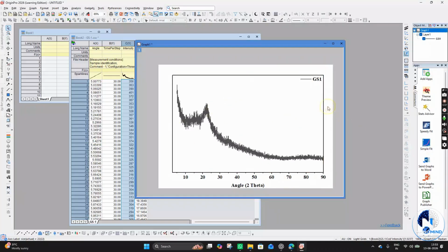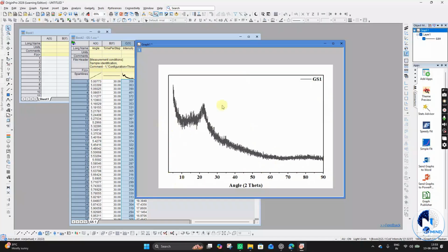Okay, even if you want it a little bit more rectangular, you can match it like this. And here, whatever space you have maintained, you can maintain the same space here, it will be the correct space. And here you can move it a little bit up, just select it and press the up button, it will move. Okay, and this is enough.